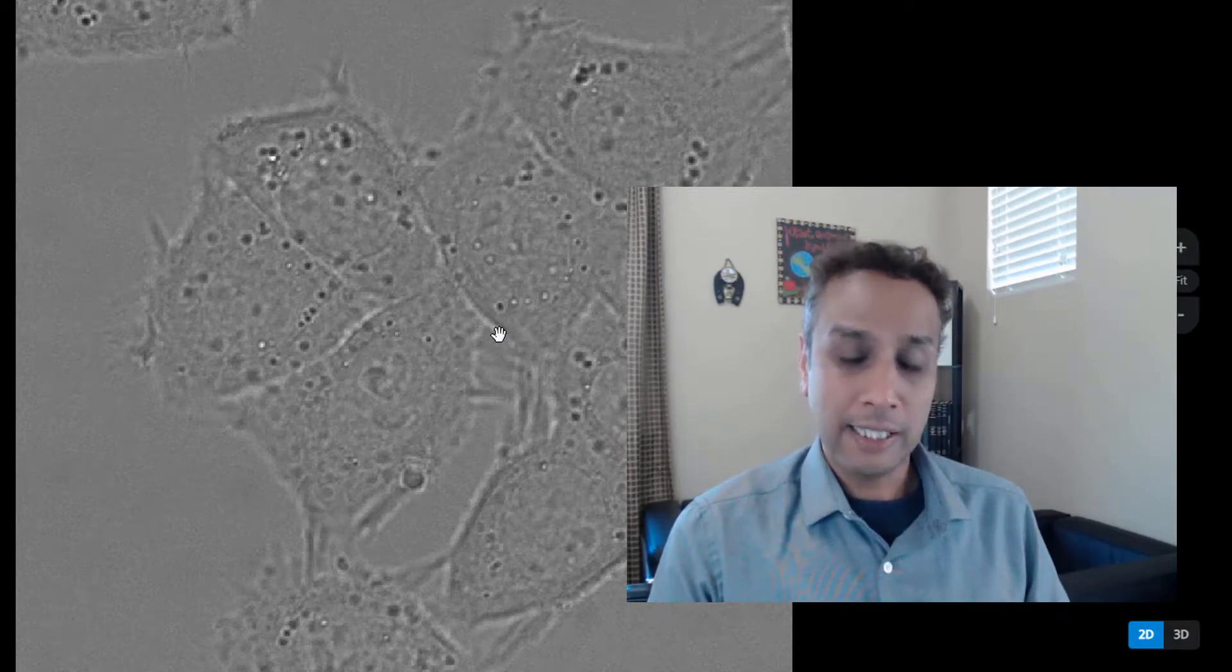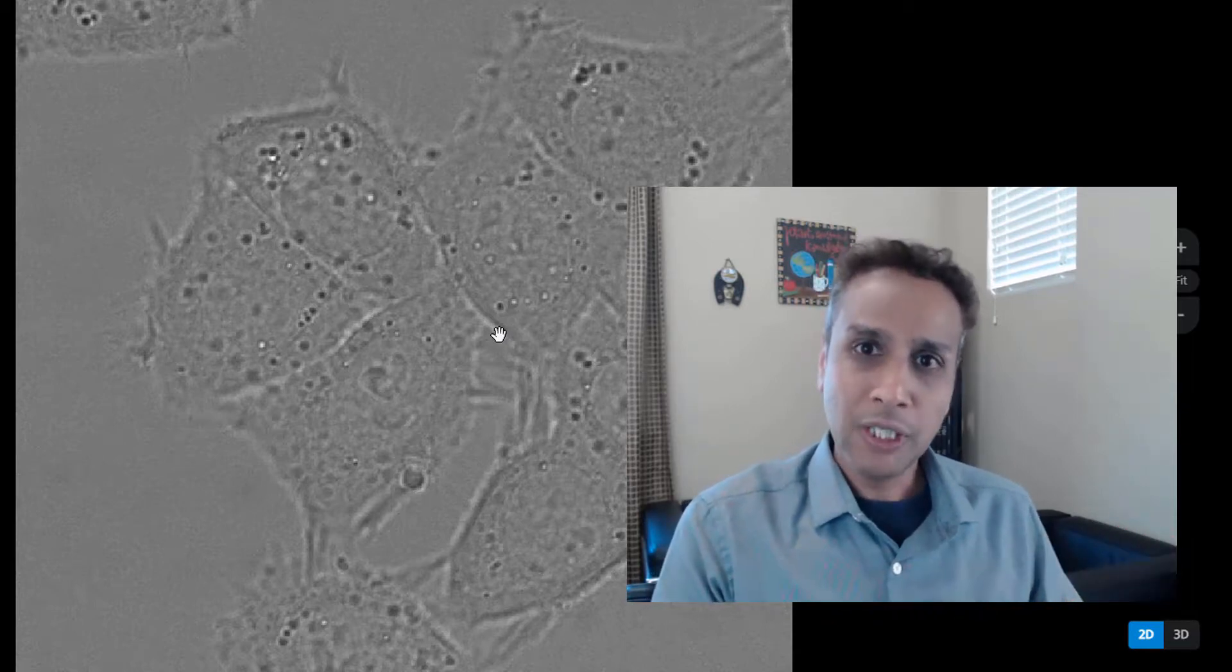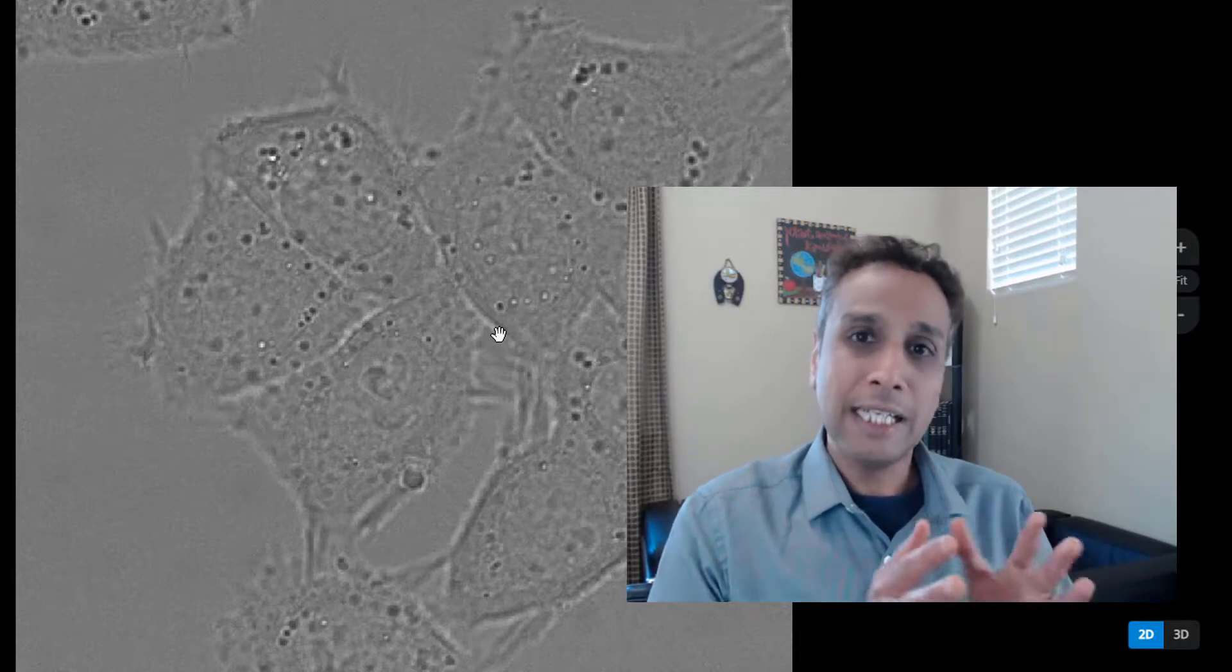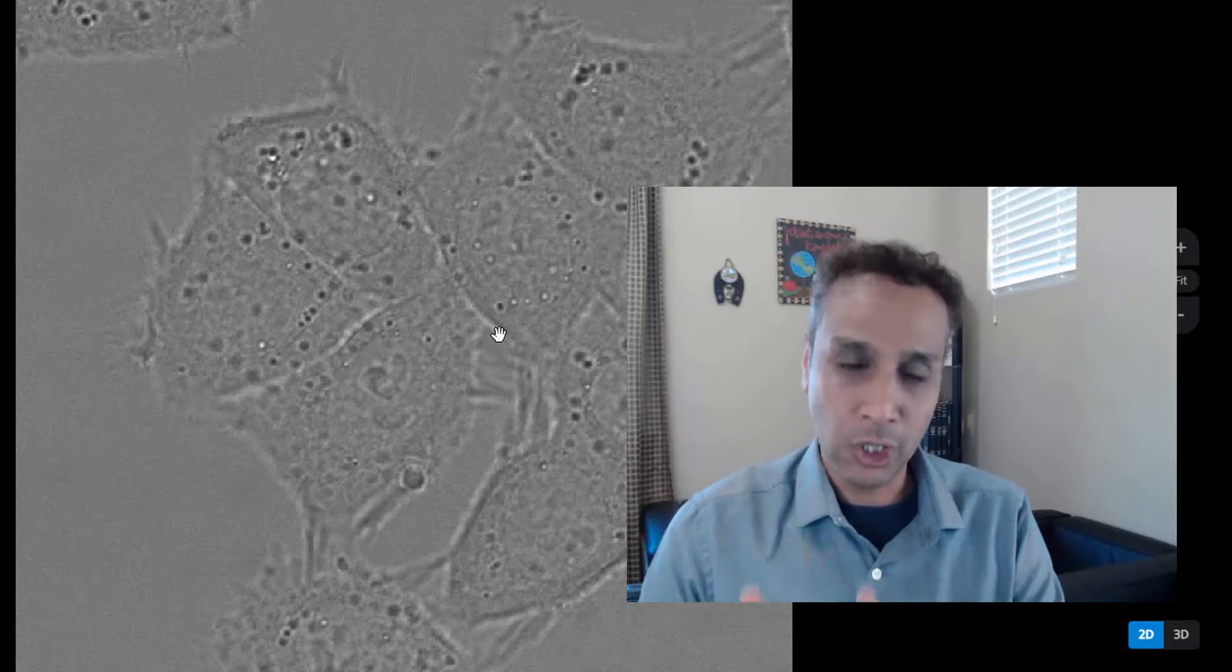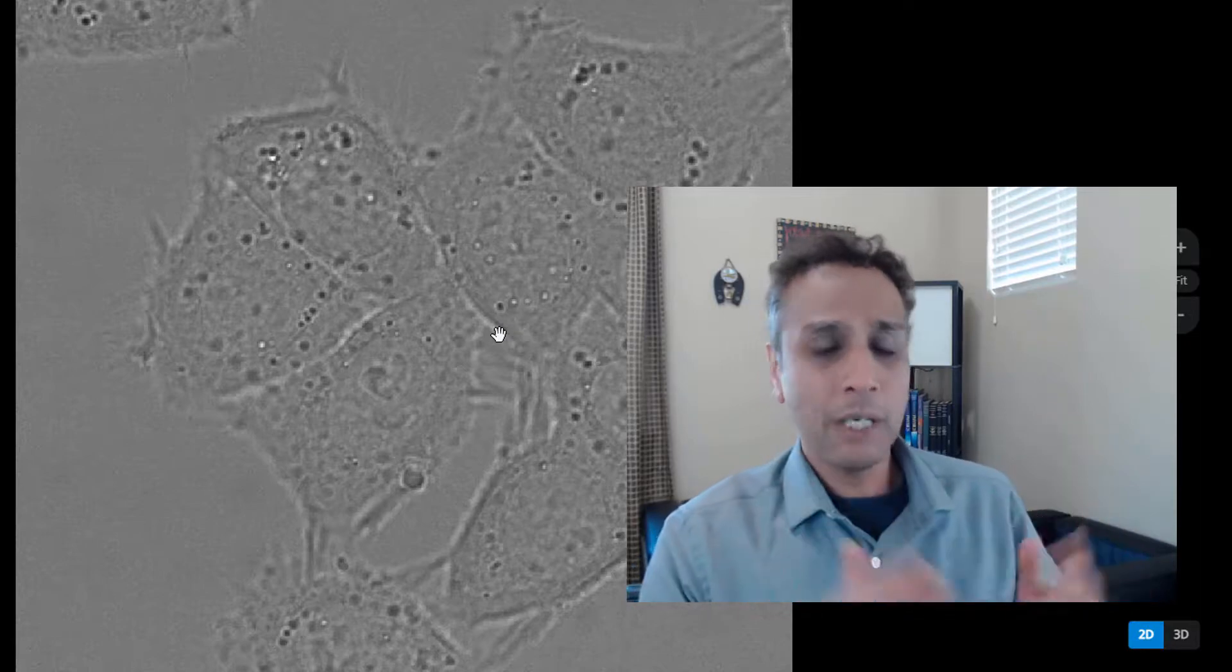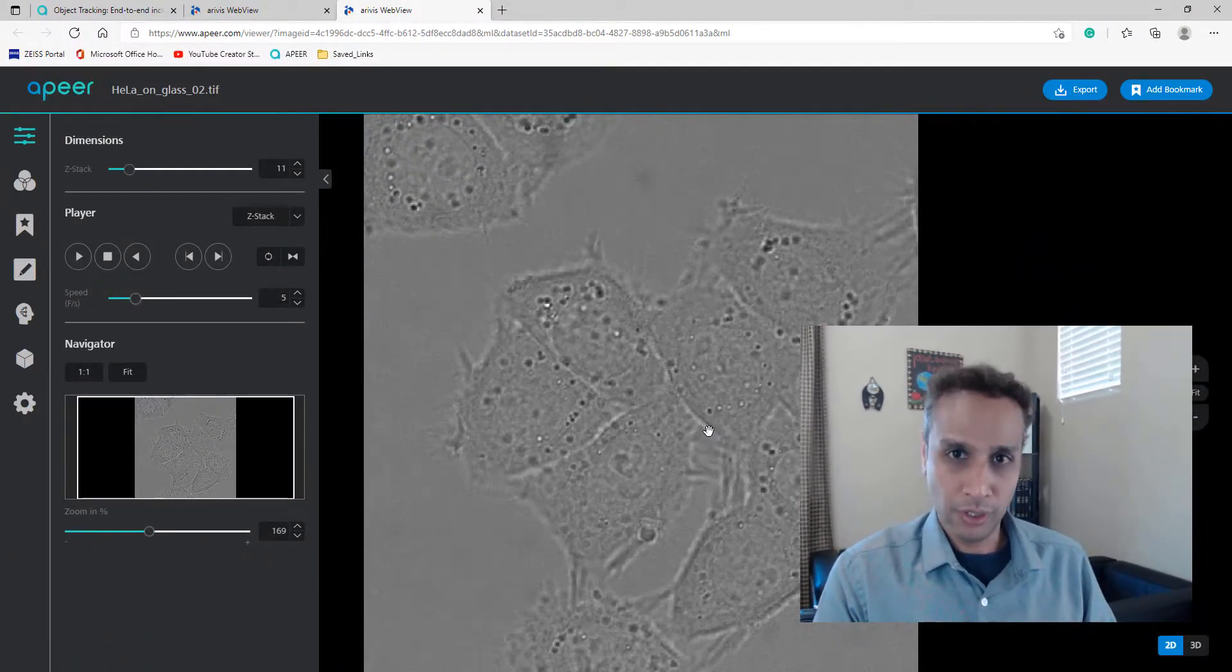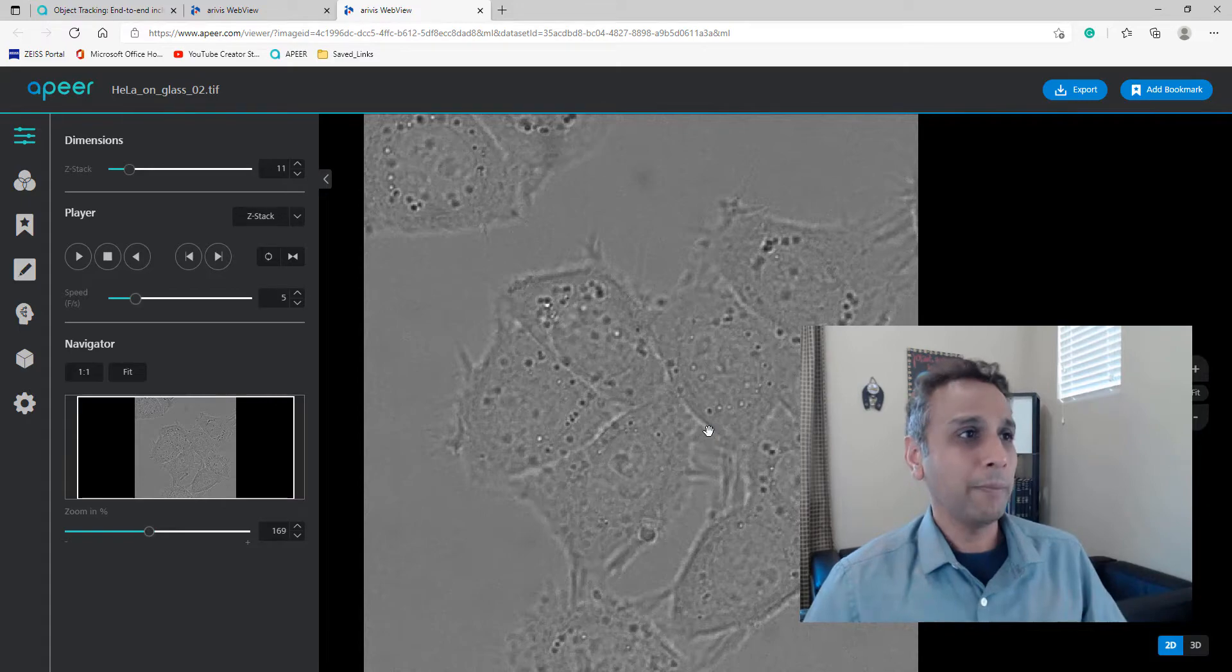In some cases, images can be challenging for segmentation. For example, if you look at this image, this cannot be segmented easily using simple thresholding. These may require deep learning approaches, which are available on Apeer. Go ahead and explore the machine learning tools on Apeer, and if you have Xen, explore Xen Intellisys.